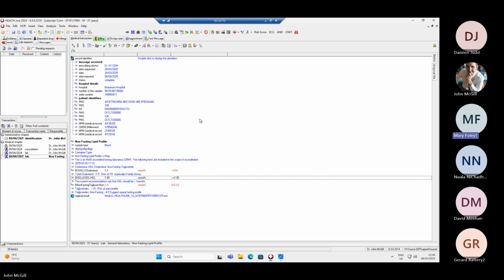And what's the maximum length, John, that they have to be, those codes? Do you know? I couldn't tell you off the top of my head there, to be completely honest. Mary, it would be a guess. Okay, I think it's 100. I'm not sure though. It would literally have to look in the database to see how long that would be there.